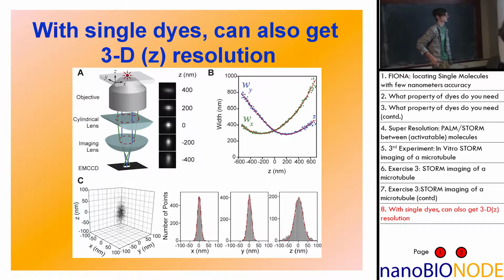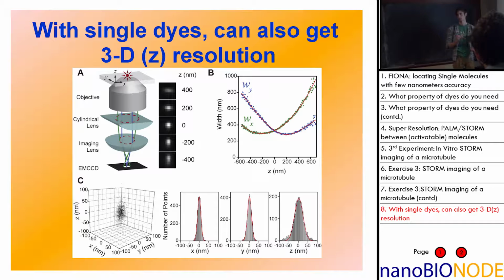The first thing I assumed is that you have your in-plane focus as a reference. So you're trying to determine the distance between two planes of focus of the fluorophore. So for the 0, and we're just using -400 as our two images, you should be able to generate a Gaussian for both the x and the y direction, and they should be fairly independent of each other. So from the two Gaussians you get from both the 0 and -400, you can determine a full width at half max for the x and y directions independently.